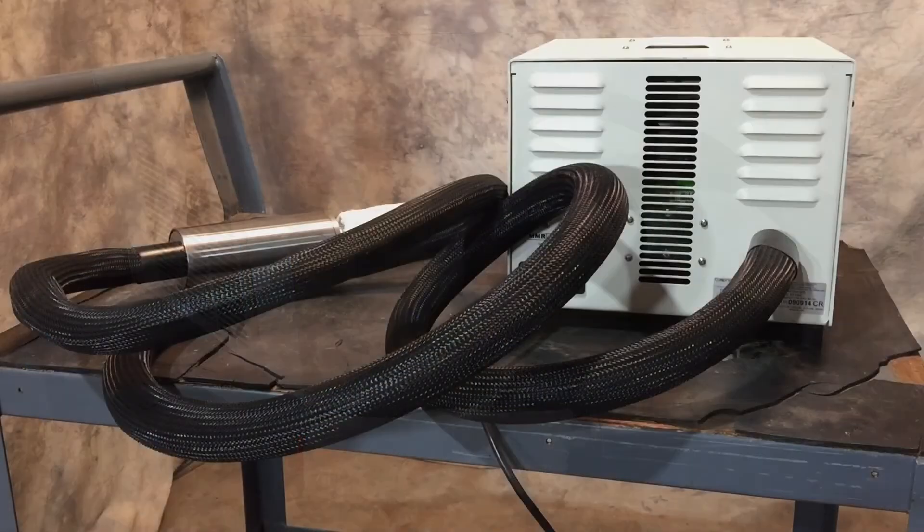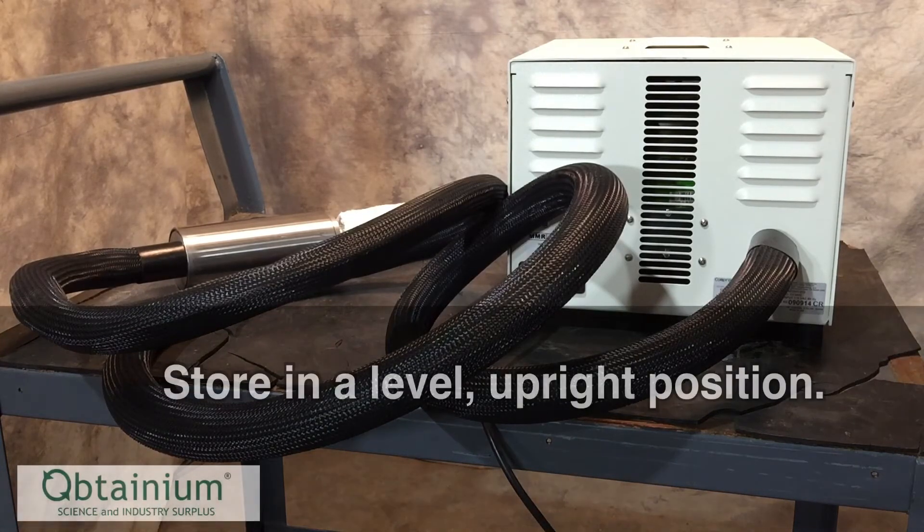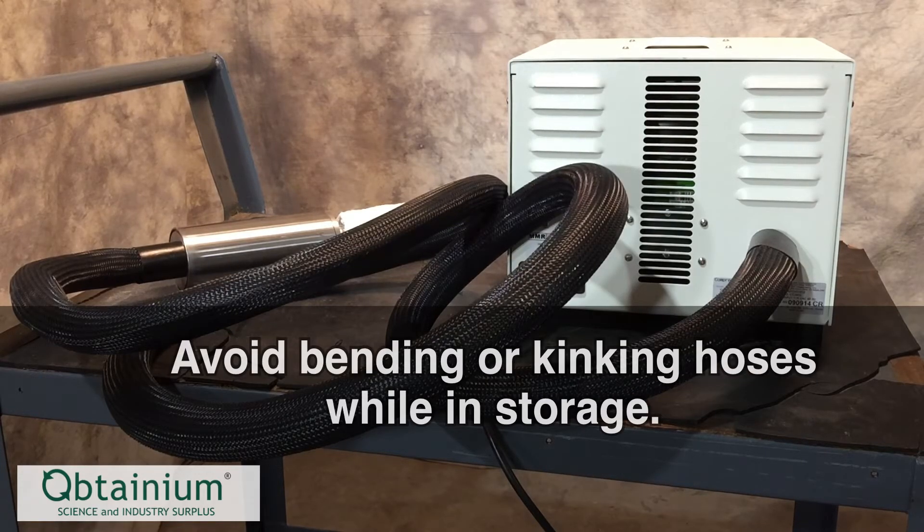When the cooling head has come up to room temperature and everything feels comfortable to the touch, we go ahead and move it into storage. When transferring to storage, we're mindful of keeping it level in an upright position and careful to leave the hoses relaxed and coiled how they naturally wish to lay, to avoid kinking or damaging the fittings.